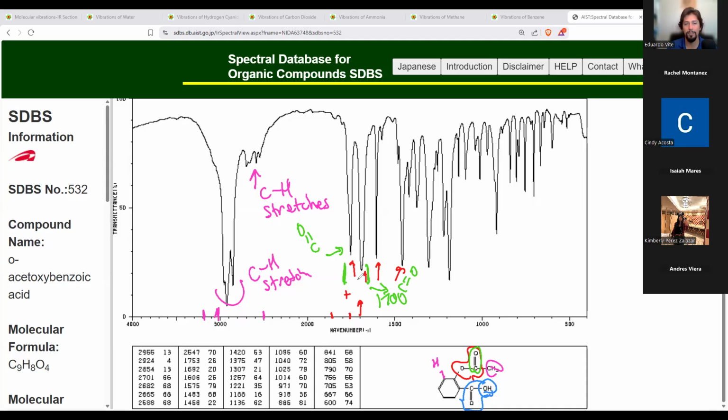It's a type of acid of some sort. Contains carbonyls and hydroxides. What's it called? Carbonyl plus hydroxide. A carboxylic acid. That's right. It's a carboxylic acid hydroxide.